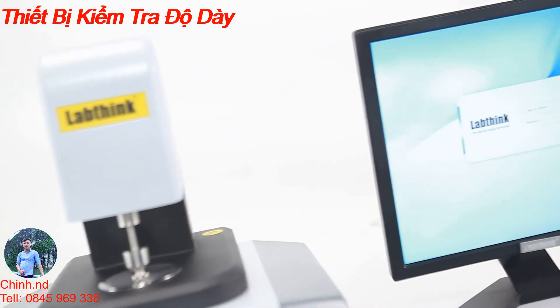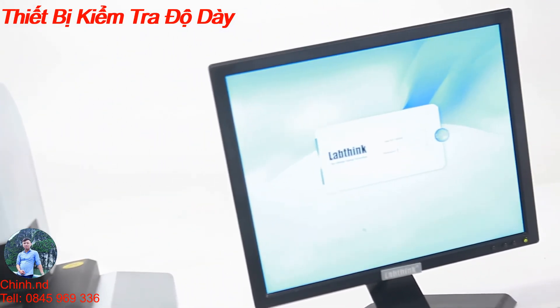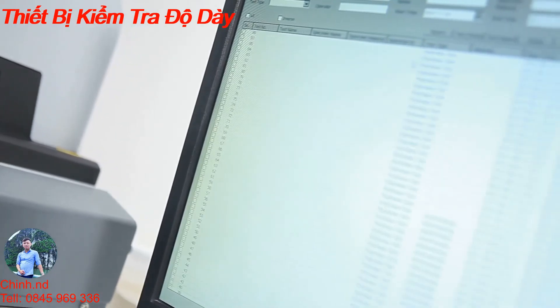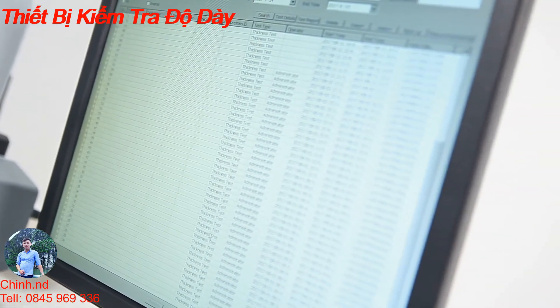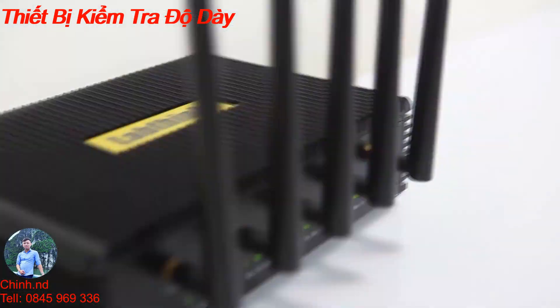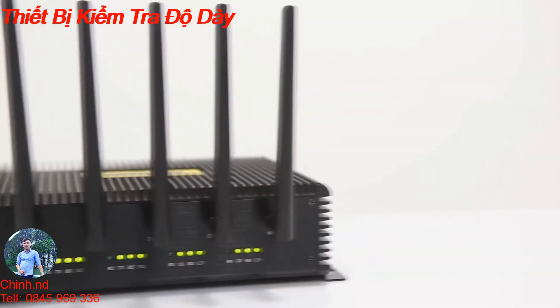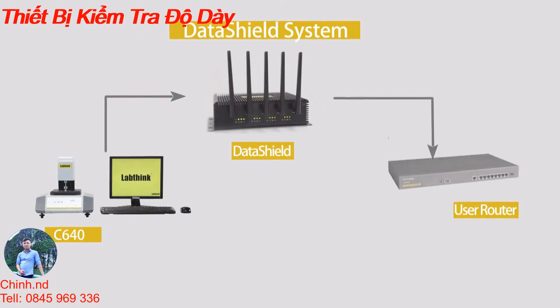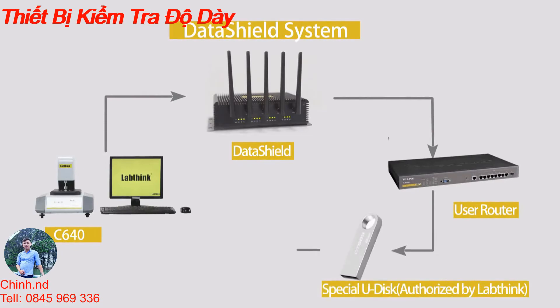C640 is embedded with LabThink's latest operating software, which features a user-friendly interface, intelligent data processing, strict user management, and secure data storage. It also supports LabThink's exclusive Data Shield option, which provides users with safe and reliable management of test data and test reports.